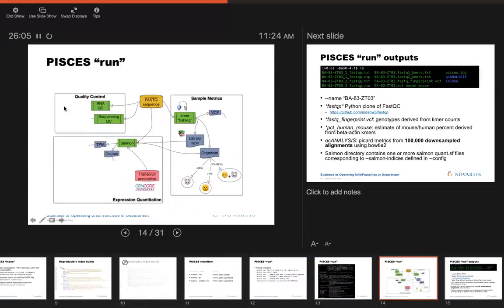So you run this single sample, one library per sample analysis, and what you get out are sample metrics. I shortened this and didn't go over it, but we're generating a VCF file. I'm generating a VCF file just based on K-mer counts of 226 high-frequency human polymorphisms. These are also present on the Affymetrix SNP6 array. We have historic fingerprinting data for tens of thousands of samples, and we can match our RNA-seq libraries to the data that already exists inside our organization by generating a VCF file from these K-mer counts. I should have put the slide in here because I think it's a great idea.